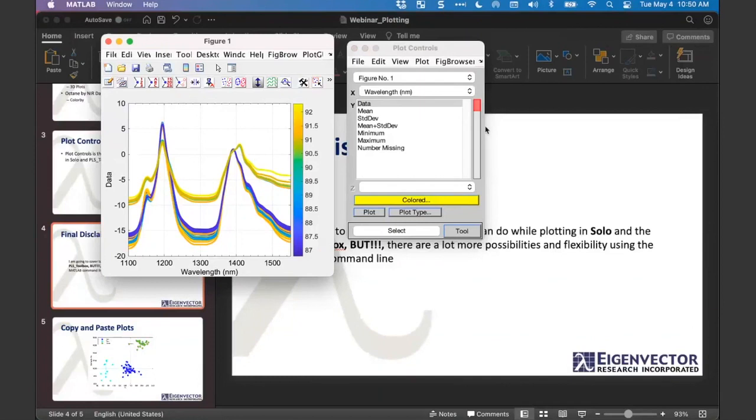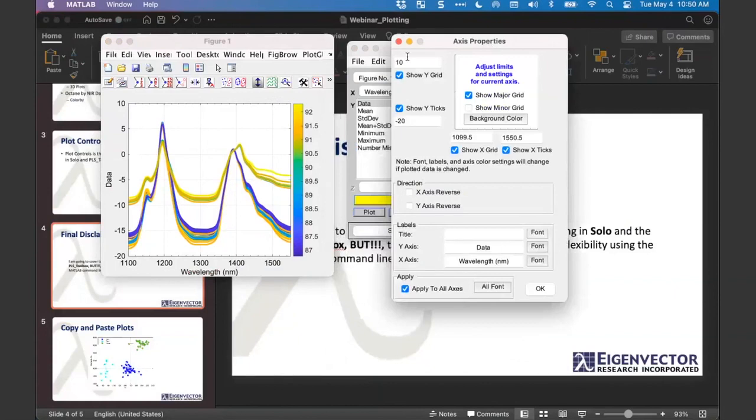Oh, hold it. Here's another question coming in. How can I recreate an ROI? I assume that's not return on investment. Or are we looking at a receiver operator curve? Is that what we're thinking? I'm not sure. Region of interest. Ah, region of interest. Okay.